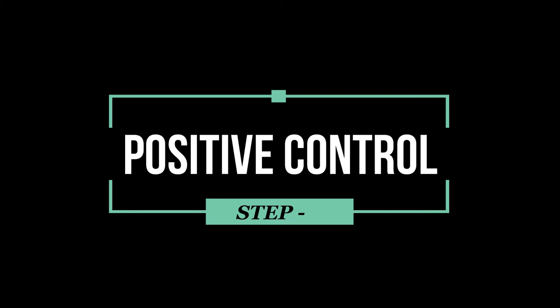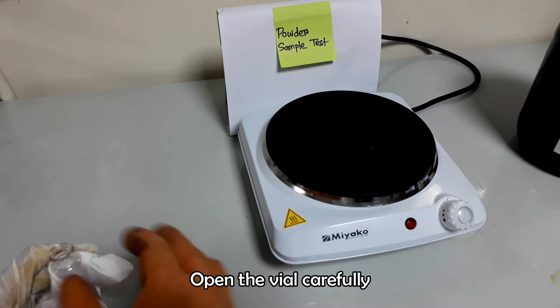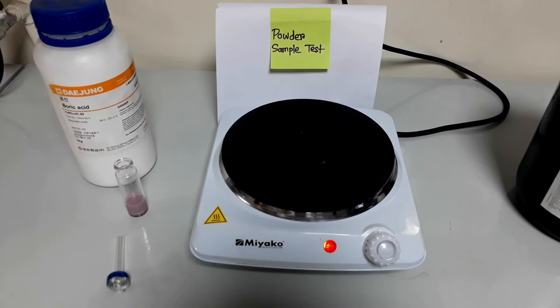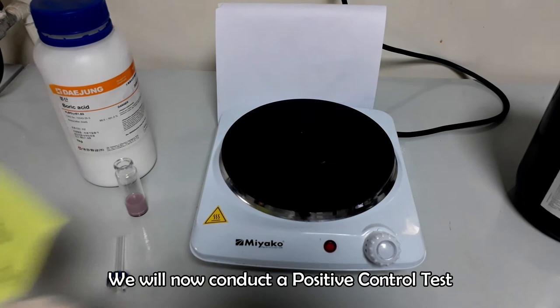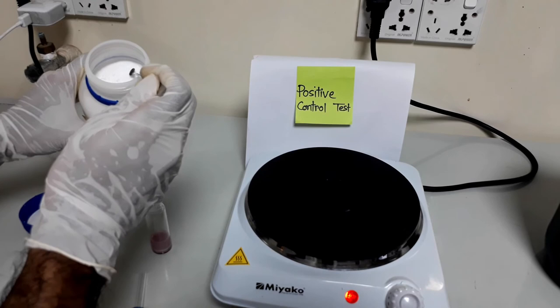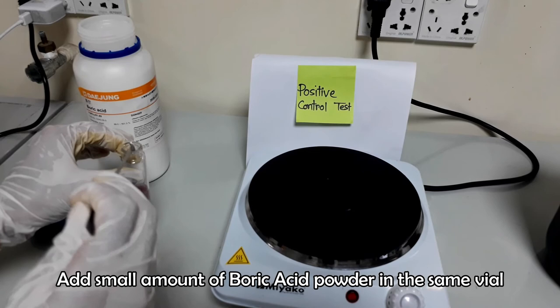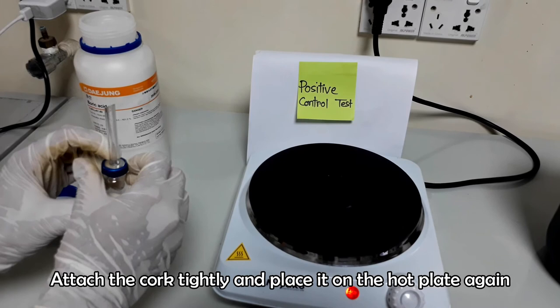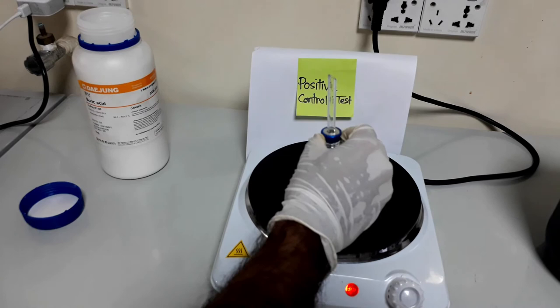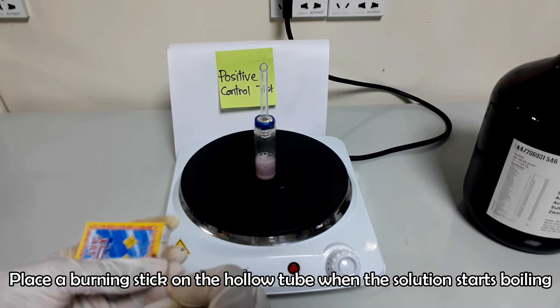Let's check the flame for positive control test. Open the cork and add a small amount of boric acid powder to the same vial and boil it again as it was done before. Place a burning stick on the hollow tube when the solution starts boiling.